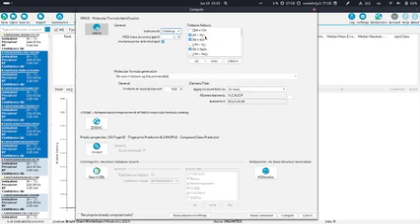We have also some fallback adducts to select here. This really depends on the data you are loading into SIRIUS. For example, if you used mzmine before to get your data, you will probably also have some adduct assignments, and these will just be used. But SIRIUS, as we already showed, also does an automatic adduct assignment. If this adduct assignment fails, here you can select the fallback adducts, which will be used if we are not able to detect the adducts. And you can also enforce these fallback adducts to be used even if we automatically detected the adduct.